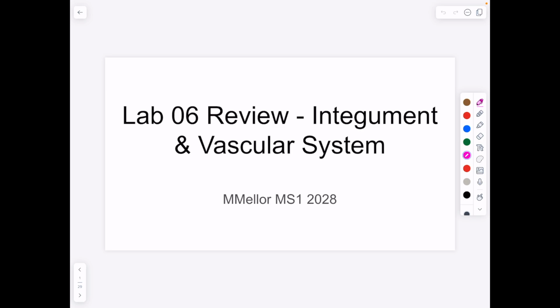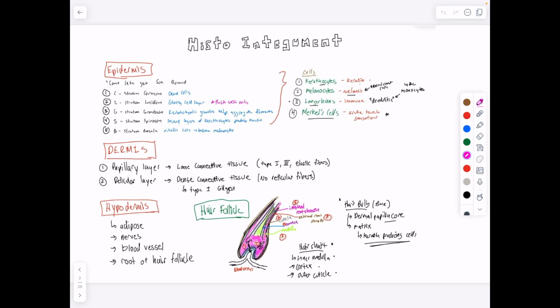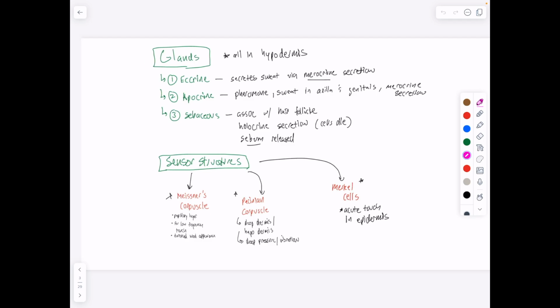Hey guys, this is our Lab 6 review video. I'd recommend checking out the one that Professor Braun gave us, but this is just the same material condensed. And the purpose is easy to learn by teaching as well. So, all right, the layers of the skin: we have the epidermis, dermis, hypodermis. We'll go over the hair follicle a tiny bit, and then we have the different glands and sensory structures.